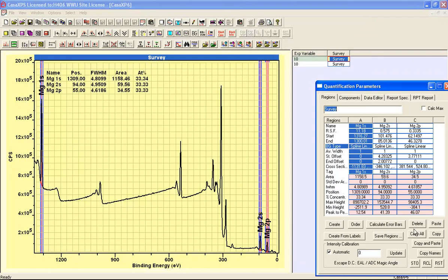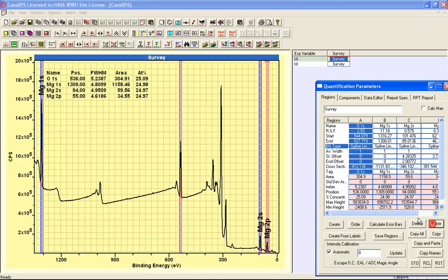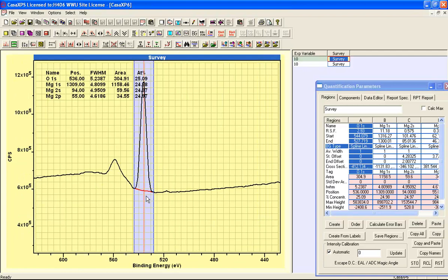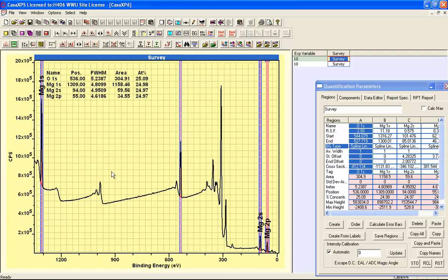Now if I paste back an oxygen region, then again using a spline background and some license in how I've defined the background, once again it does illustrate that with the right background shapes, these corrections do produce what you'd expect. So there's the same amount of oxygen as you'd expect from each one of these. That's because it's MgO.